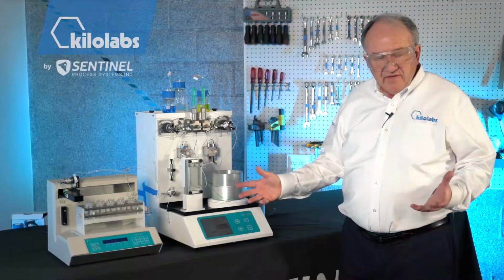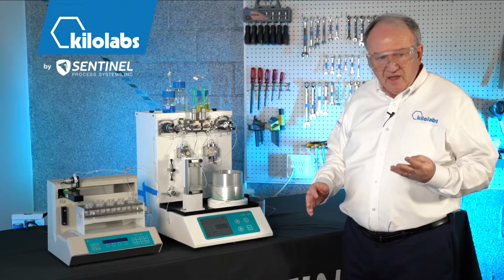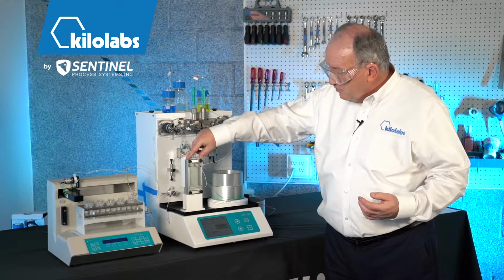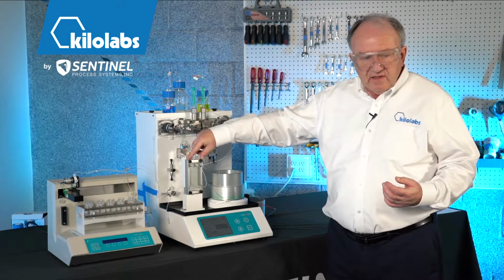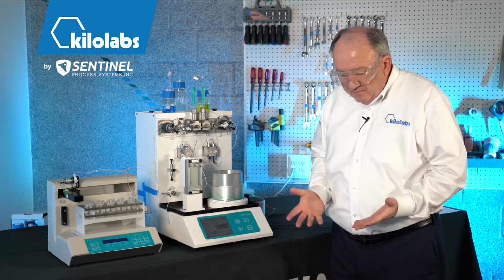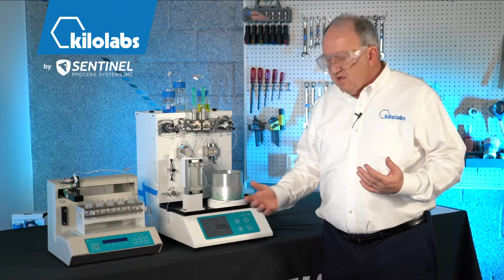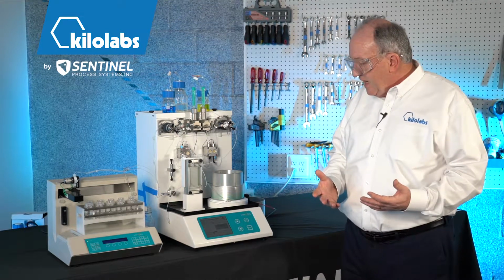Why is that? The reason is we only committed 4 ml of fluid to this reaction, so now solvent is coming through and rinsing out the rest of the fluid in the mixing chip. That's going to push everything through the overall system to the point where it gets to the fraction collector and we collect the reaction product.